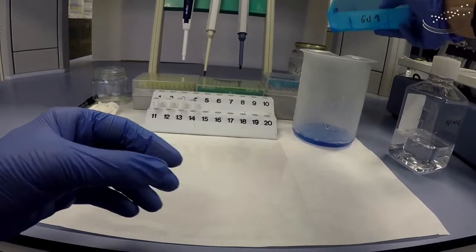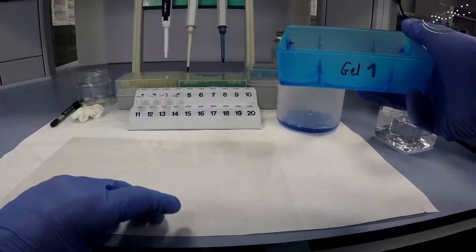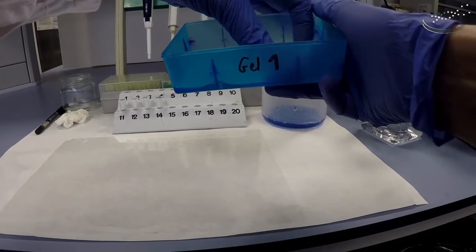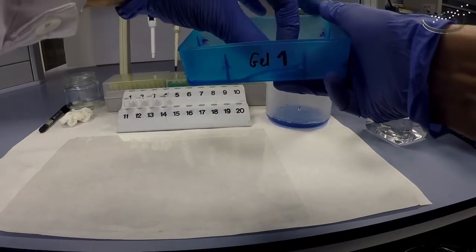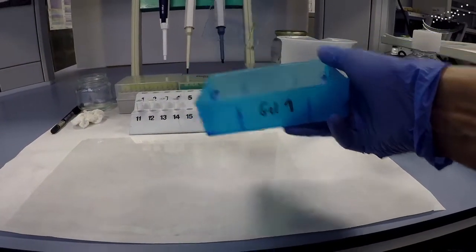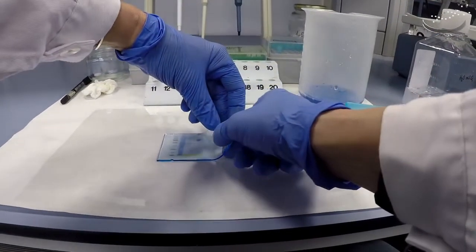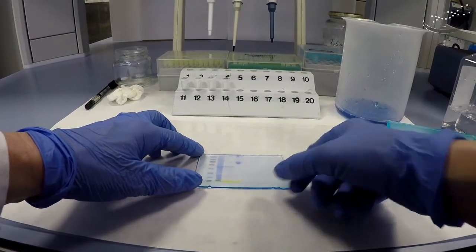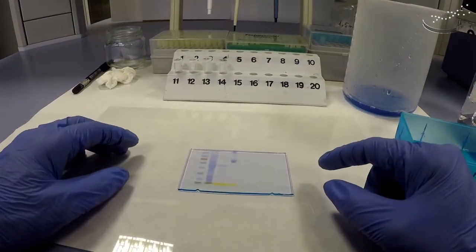We take the gel out of the box and put it onto a plastic sheet to show you the gel staining result. You can see on the left-hand side the pre-stained markers as we saw before, and in the next three lanes we can now see the staining of our different protein samples.